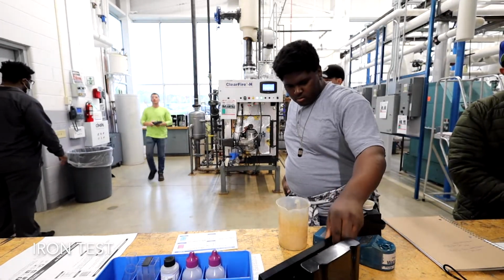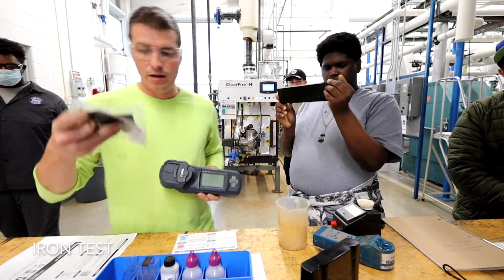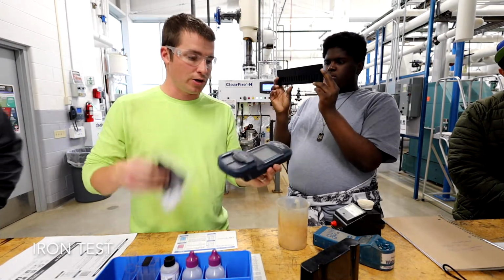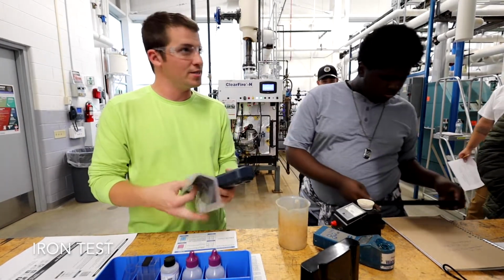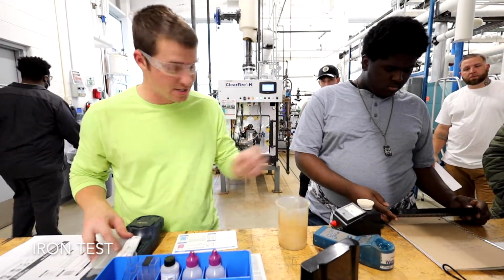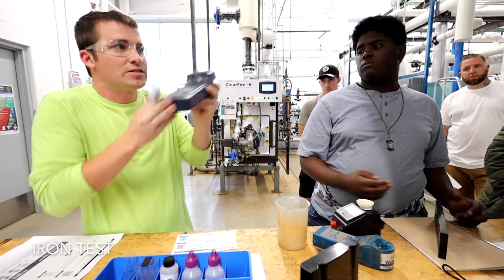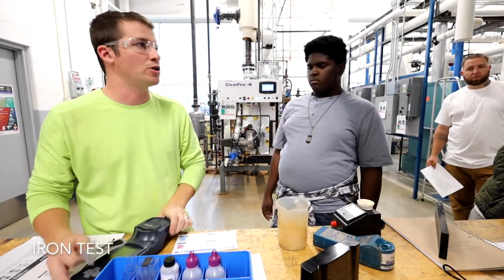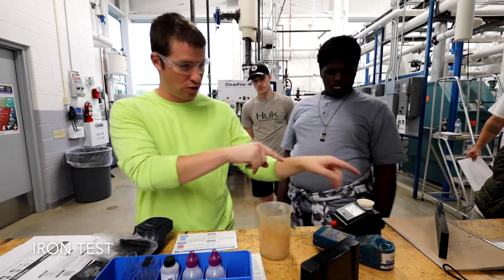You might have something more like a digital meter where I add a packet, it changes color, and it gives me a reading. For the purpose of this, that's pretty expensive, so that's why we're doing this. You might have a meter that digitally tells you an answer, rather than having to hold it up to the light. But for the sake of what we're doing, this works just fine.